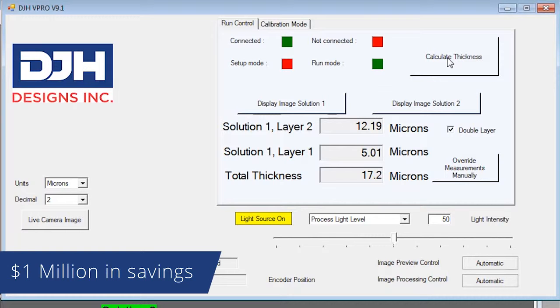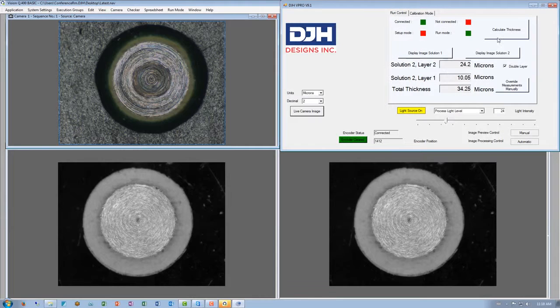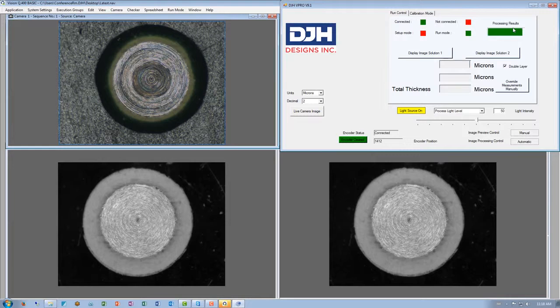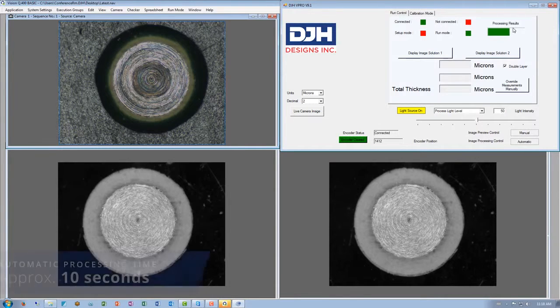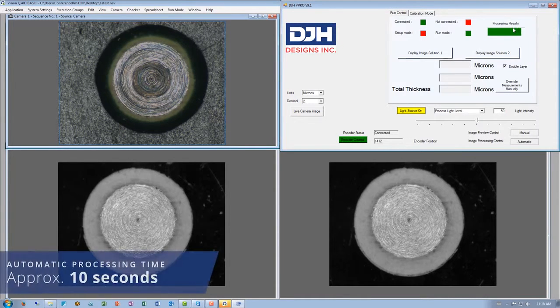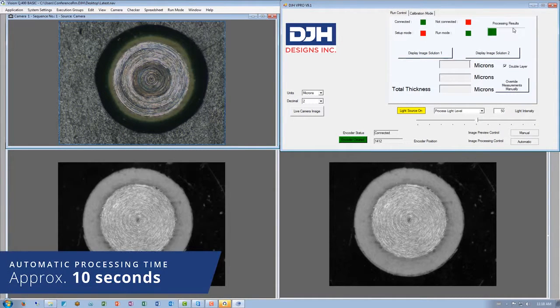In previous versions, the manual process would take an operator up to a minute to define and generate a result. vPro does this process in approximately 10 seconds with unparalleled accuracy.